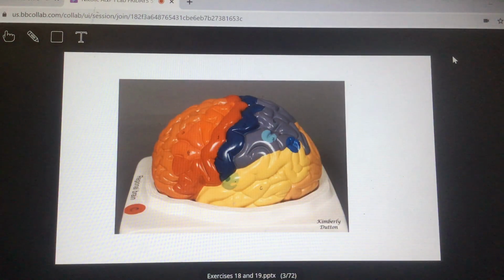All right, so we're going to knock this out. Where we are, we've got basically a number of brain models that we're going to go through. We've got a ventricle model, median head model, and then the sheep dissection. We're going to knock all of that out today. So here you can see the colored model, which again, if we see this, great. I have yet to see an image test where we're actually testing this. So let's look at this.